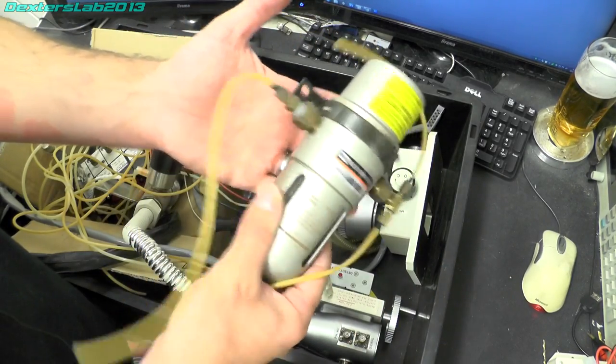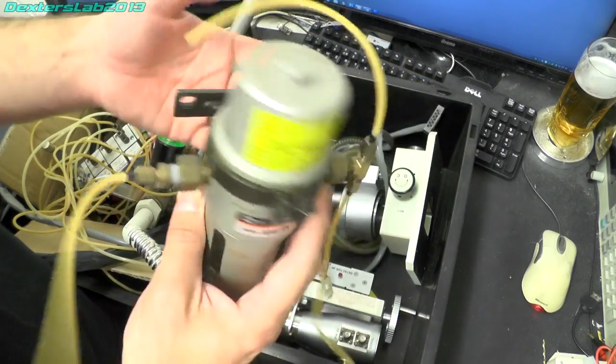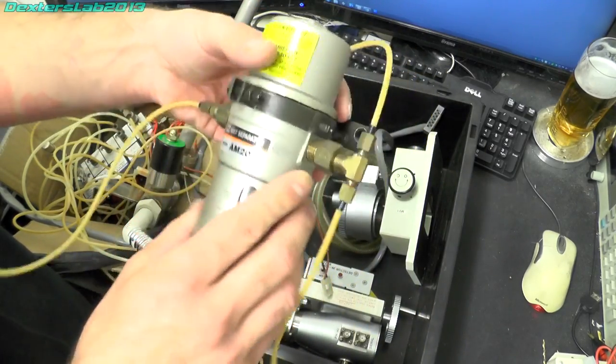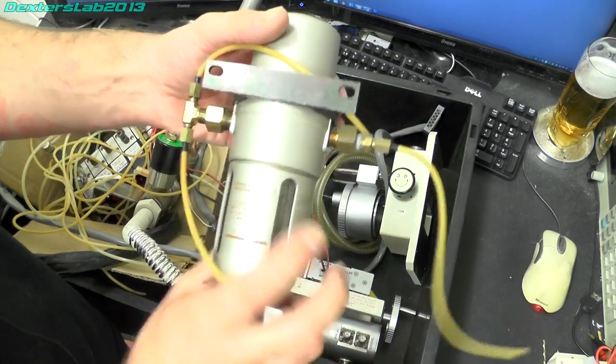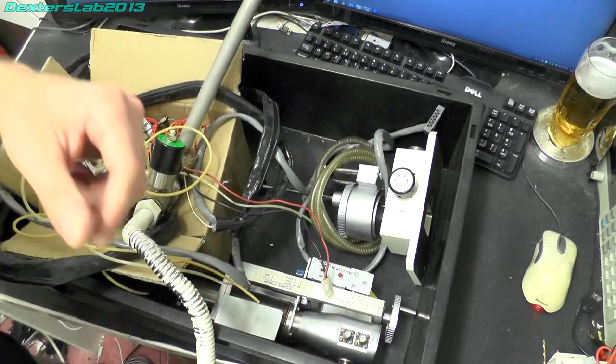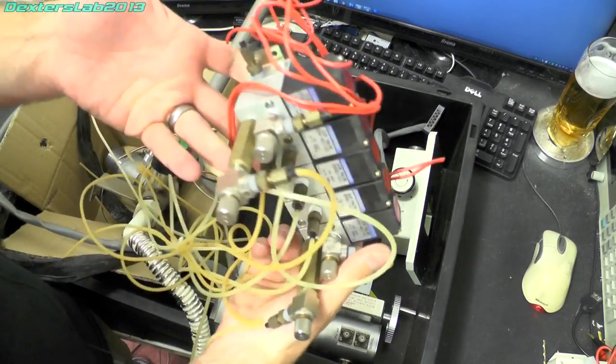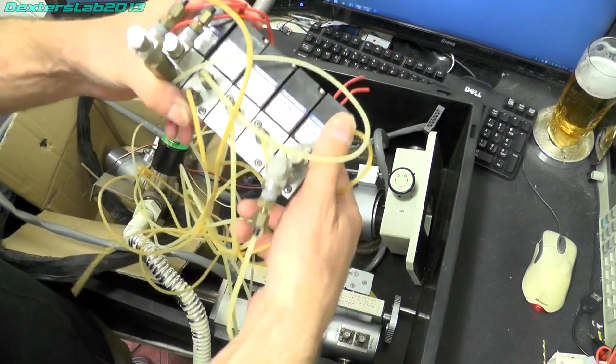This device here is a mist separator, nobody's actually claimed this but I saved it anyway, thought it might be handy to keep. This bit here is part of the pneumatic system.